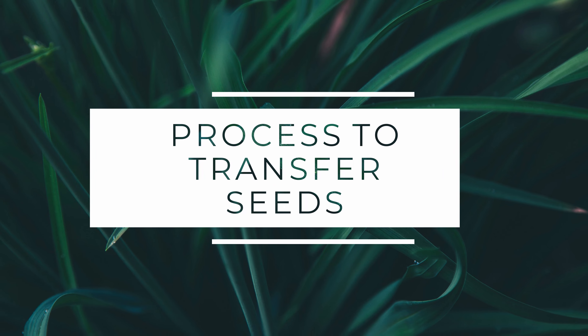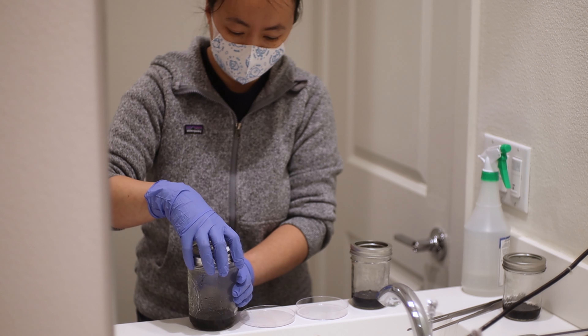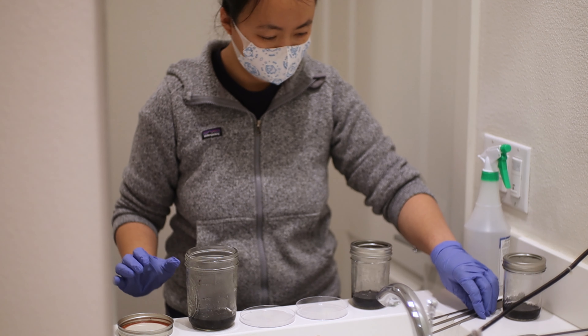For my situation, I noticed that some of the protocorns were climbing up the wall. Ideally, you want them to be in contact with the nutrient solution so that they have the best chance to grow. This gave me an opportunity to try out these replates and transferring of seedlings. When it comes to replates, it's a fairly straightforward process, but the technique and the timing are really what determines your success.